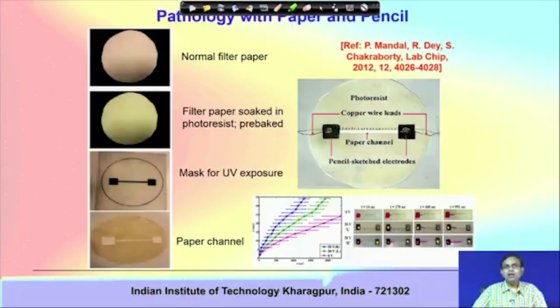Actually, we made a massive innovation in this technology by implementing two things. One is ultra low cost fabrication of the paper channel, using an inkjet printer coupled with a hot plate to make microchannels just by printing them on a paper. And the second is pencil sketching electrodes: we combine the electrodes with the paper based microchannel to make a paper and pencil based microfluidic platform.